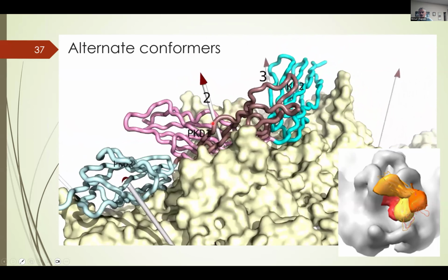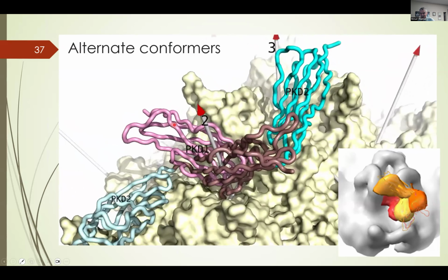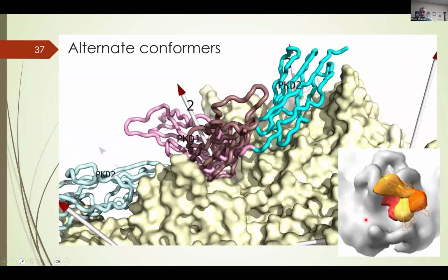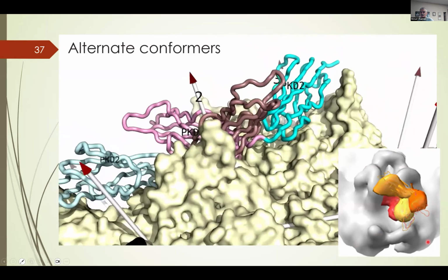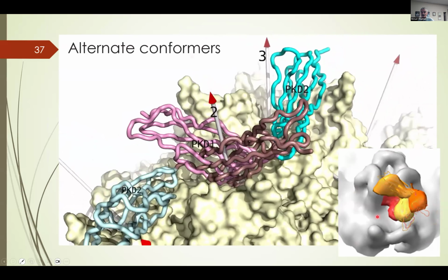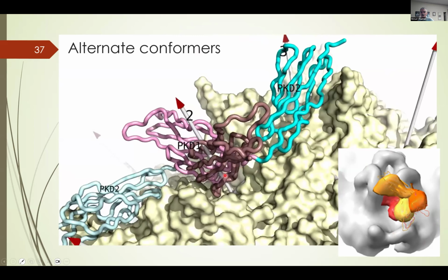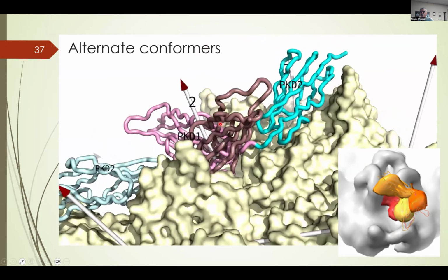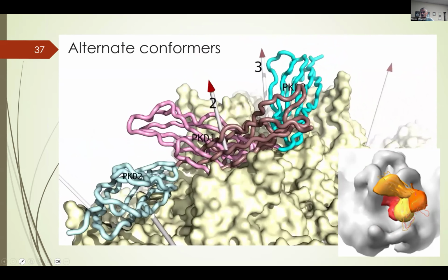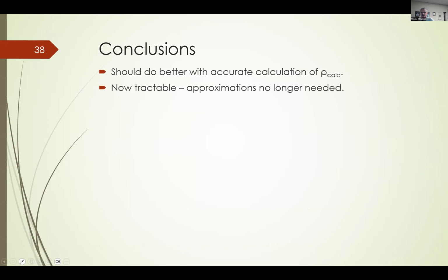So we've still got a missing one domain that we can't yet see, and we think that it's likely to be in a position similar to that seen in the complex of AAV2 by the cryo-electron tomography. And so we think that the other domain has to point away from the virus surface and is hanging off in one of several different variable configurations.